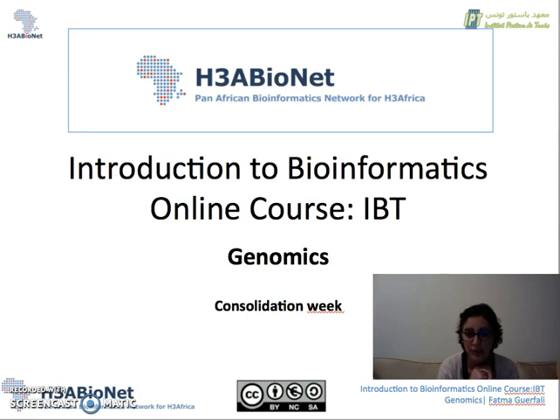So what we will be doing together is take out the information related to chromosome 1, as I told you. We will be using the command line for that. And then we are going to use the Ensembl website and especially one tool that is called Variant Effect Predictor online, and we will be using it in order to annotate these mutations. And then you also have a practical, and you will be extracting some information related to these mutations. I will be showing you throughout this example how different the information you retrieve can be if you use the command line interface to interrogate the annotated file, or if you stick to the web resources, just to make you think about the filters that you are using and how different the results can be if you are not using the correct filters. So let's first work on this file.